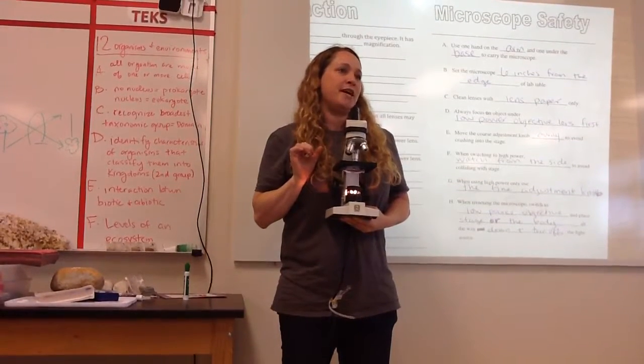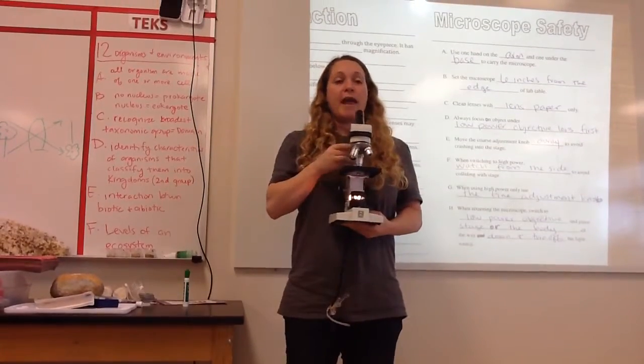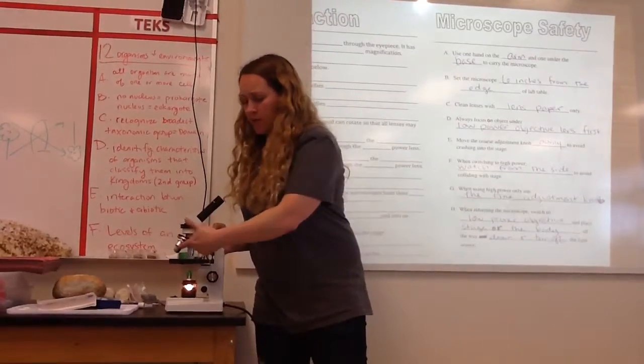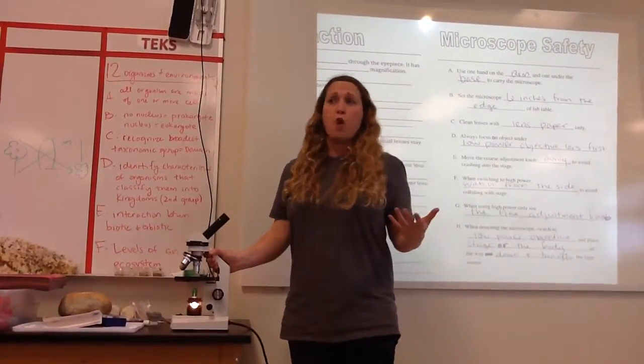Did you hear it? It's easy to feel too. If you don't pay attention though, it's easy to pass it as well. So now I should be closer. But I changed the distance between the eyepiece and the objective, so it's not going to be in focus anymore. It should still be there, but it won't be clear.